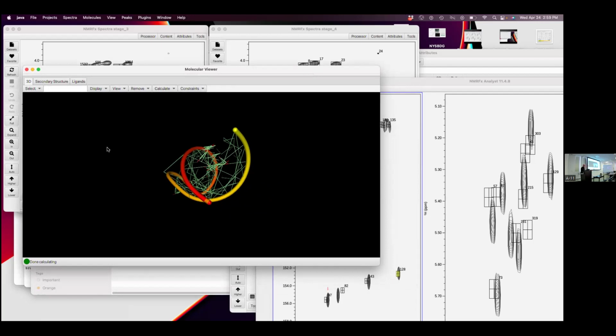Actually, at the symposium, in Frank Delaglio's talk, you mentioned that they're developing more of a package with a UI front end. For NMR, everybody's converging. You have scripts and you have UIs. NMRPipe used to be purely scripts, but they had a typical Tk interface to it for a fair while.